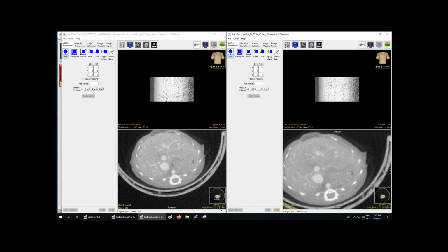And hereby we see the clear distinction where this line attaches to the ribcage and here as well. Those are both the veins, or arteries, that are coming from the aorta. So this would become our common slice. And now we're going to subregion this and then make sure that this bottom file will have this common slice and this one won't have.